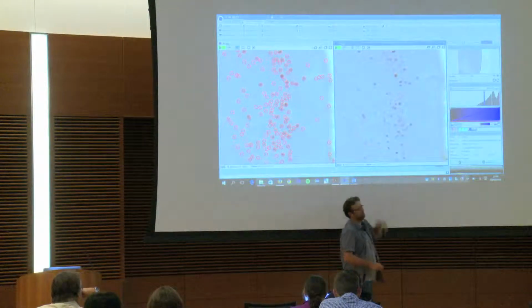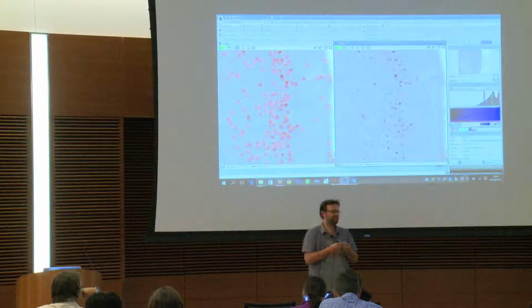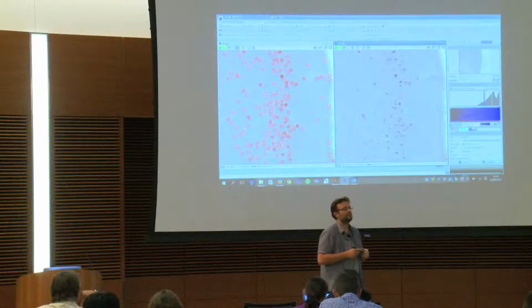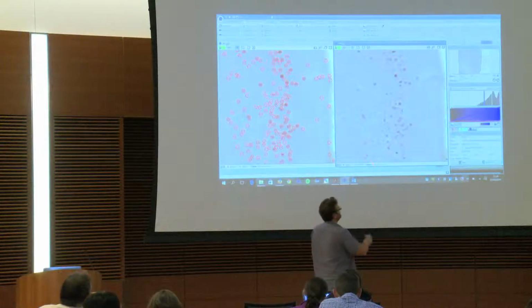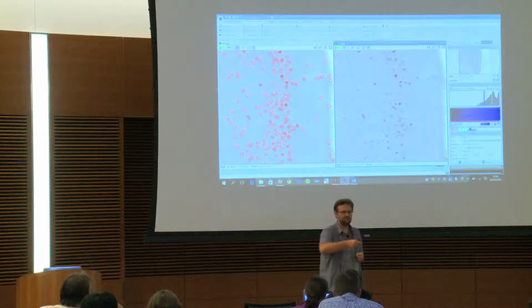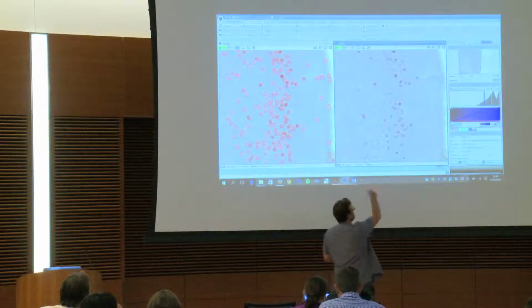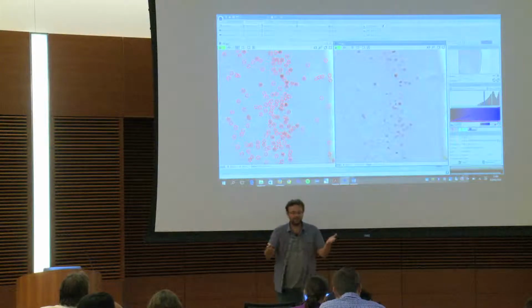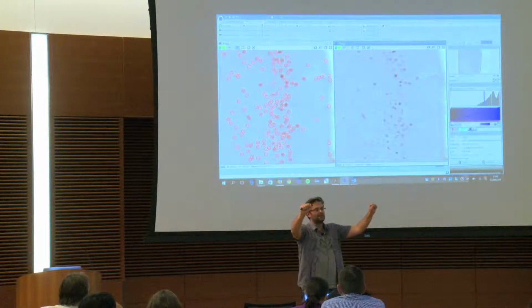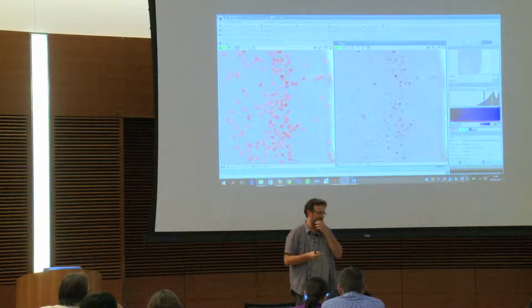So I put the first one, and the trainee comes. And I ask him, okay, just pick with a pen where you find the proper neurons. And then he's doing this. The boss is not watching what the other is doing. And then the boss is coming, and he's doing the same. And then I take the 2 papers, and I put them like that. They are different, and everybody is laughing.